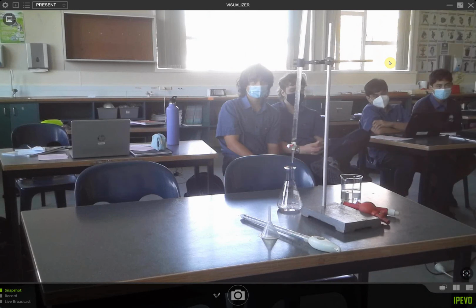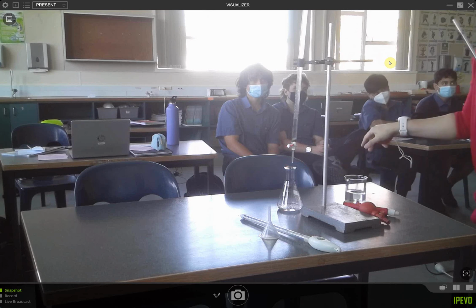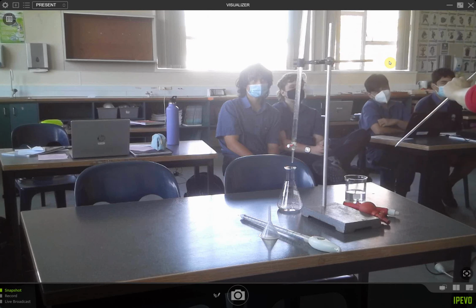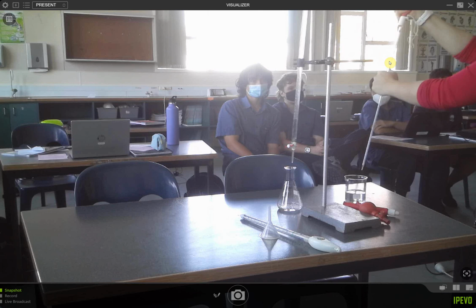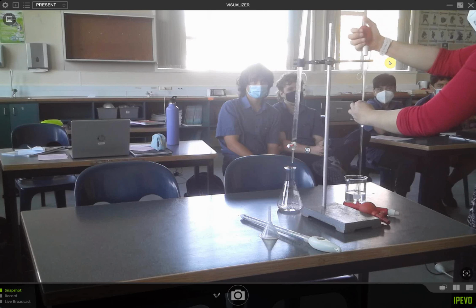So, with these pumps, I'm making sure you can see it on camera. Yeah, you guys can see. All right, so we're going to squeeze out the air, put it on the end of the pipette, and suck up the liquid. Now, it's going to take a while because I chose the 25 one, and hopefully there's enough air for it to take it.